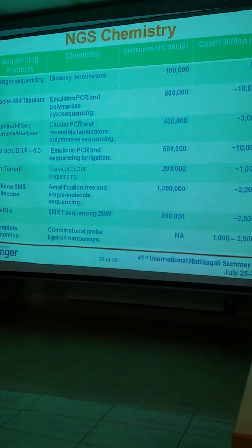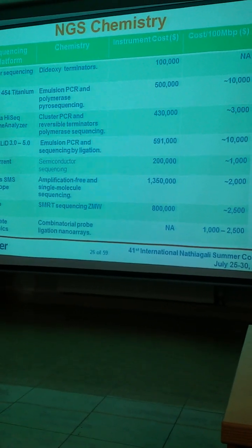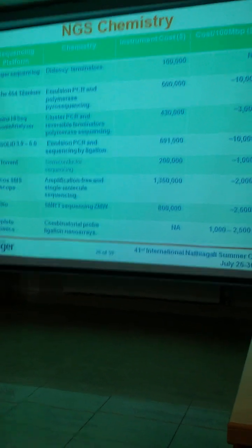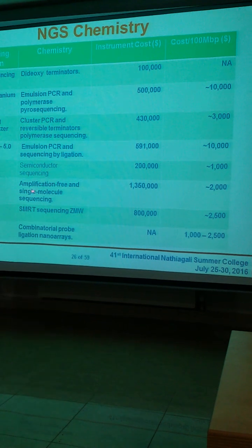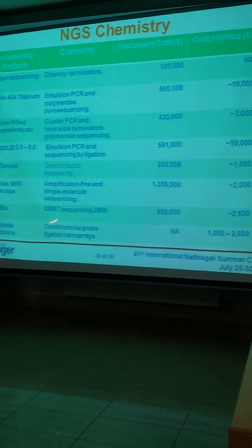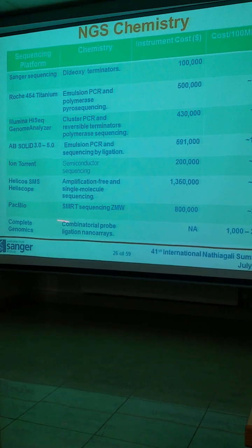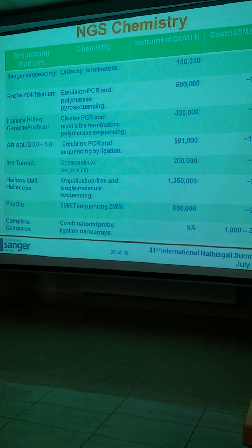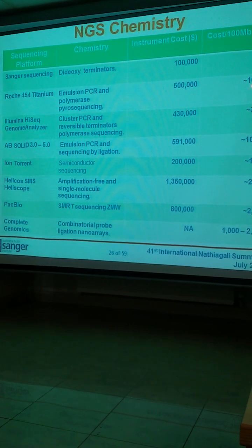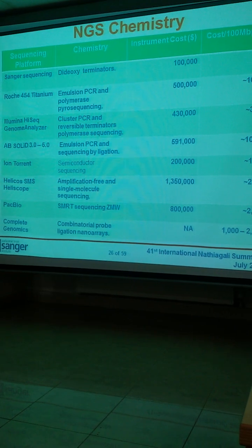So if you're interested in a particular gene and you want to sequence, let's say, 2,000 or 3,000 individuals, you just do a PCR amplification for that gene and then run it on one of these sequencers. This is obsolete as well. I'll also probably, at some point, show a PacBio video, which is interesting as well. And then Complete Genomics uses combinatorial probe anchor ligation, which the paper was published a few years ago. These are the costs over here. They've probably gone down, if anything, over the last 2-3 years.